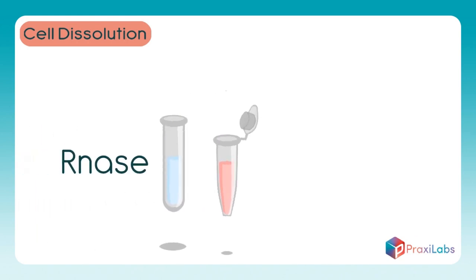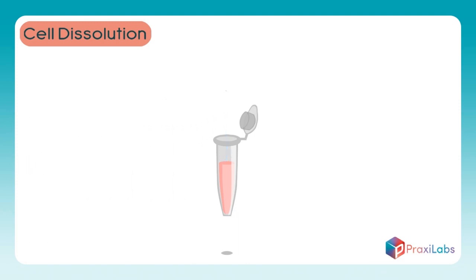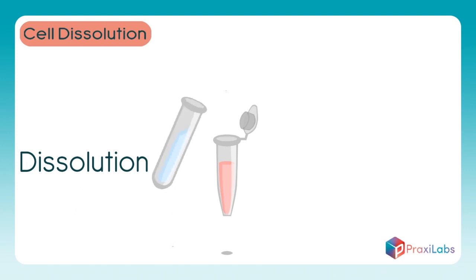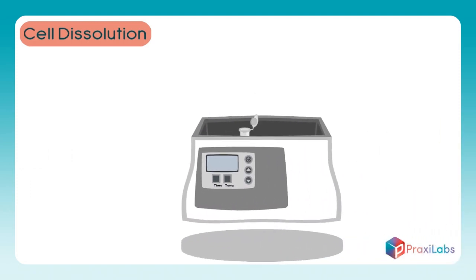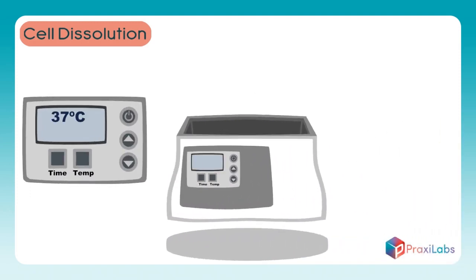Prepare 10 microliters of RNAse enzyme and add them to the DNA sample. Add 700 microliters of dissolution buffer to the sample. Place the sample in the water bath at 37 degrees centigrade for one hour.